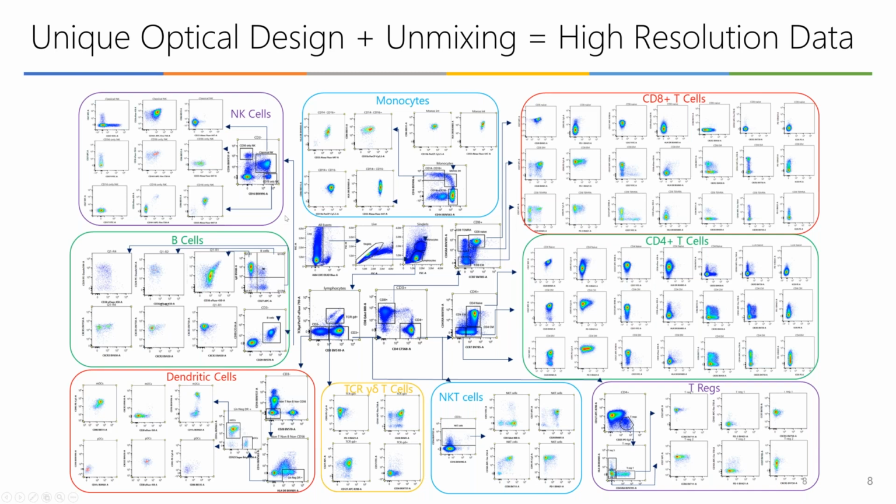But the slide also reveals that for this highly complex panel, manual gating has limitations. It's time-consuming, it's limited to the investigator knowledge, it's subjective, and it can be error-prone even in the hands of experts. And also a critical point is that you might be missing the presence of other populations, since we tend to focus gating only on cell subsets that we know or that are relevant for our study.